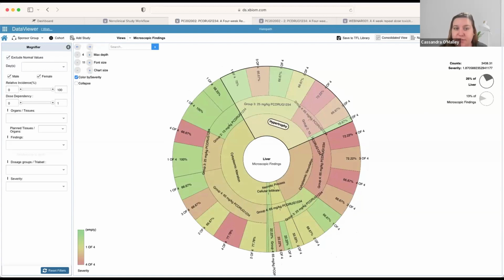As we've discussed in our previous webinar, SEND datasets are generated based on an already completed study. The report is already completed at the time that the SEND dataset is created. Some of the visualizations that I've shown are only usable once the study report is completed, specifically this microscopic data. It's great for QCing SEND datasets where it's pretty common to have MI data done at a separate test site and then later incorporated into the full dataset.